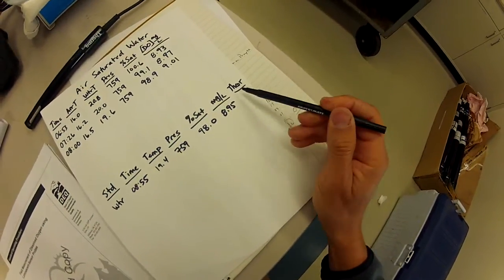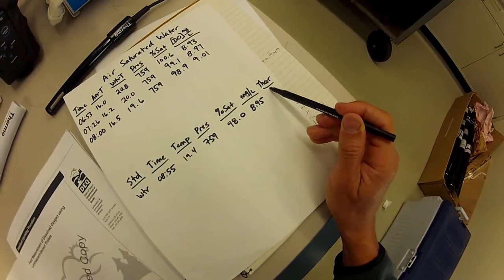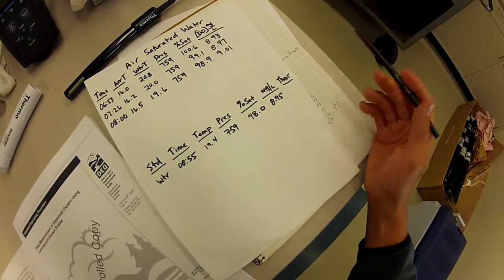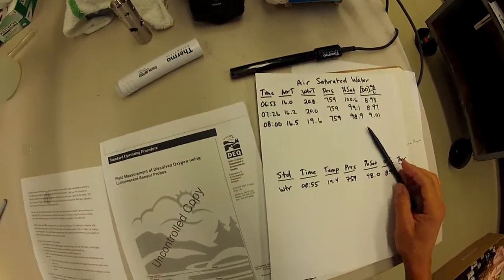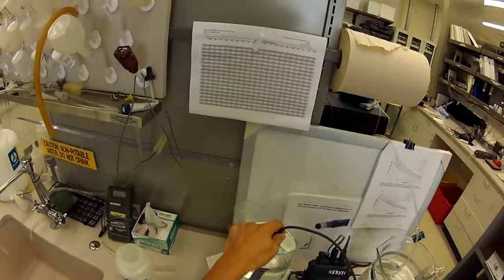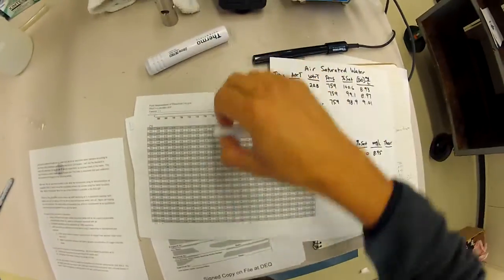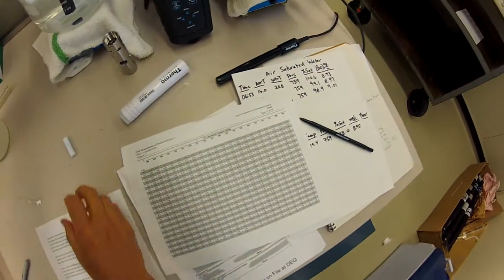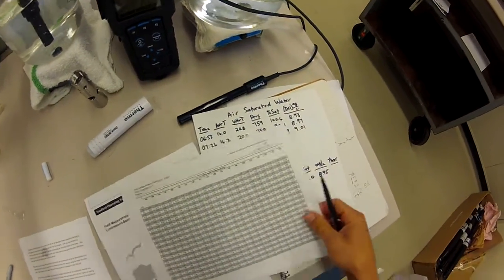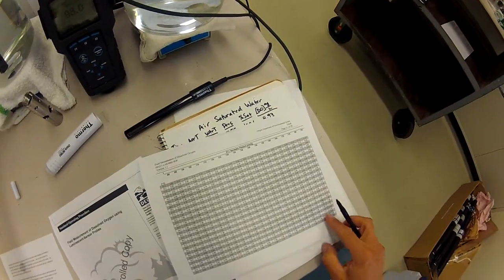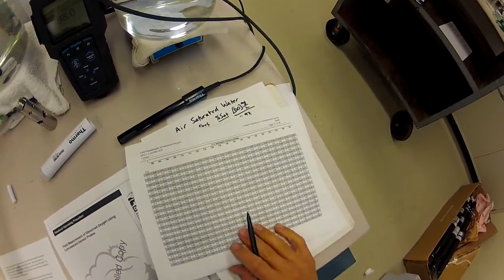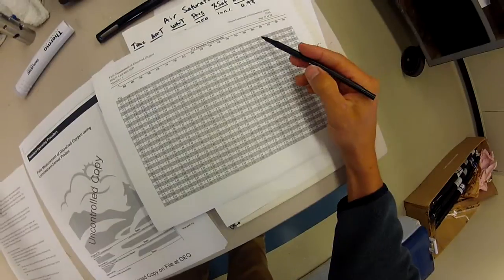This here is the theoretical reading. The theoretical reading is going to be that predicted value that we talked about based on temperature and pressure. USGS has a great website. If you search for USGS DO tables, it's got a calculator for you where you can enter temperature and barometric pressure. The same formula was used to generate this table.